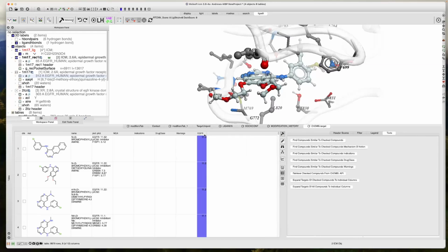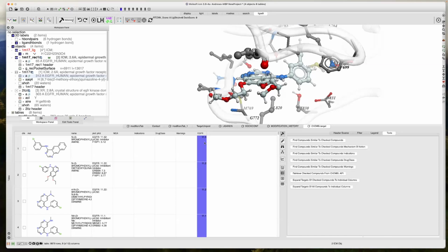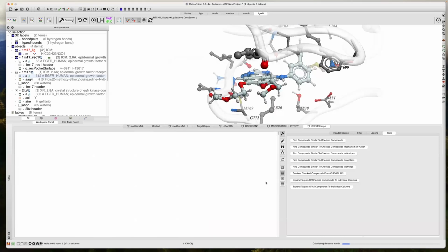And so this is ranked by pKd. So these are very, very strong binders. What we're going to do in future webinars is virtual screening, to screen and score these compounds. But if you wanted to, we can cluster these quite quickly.